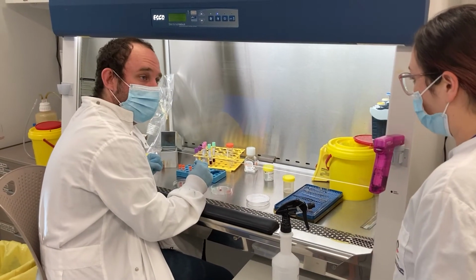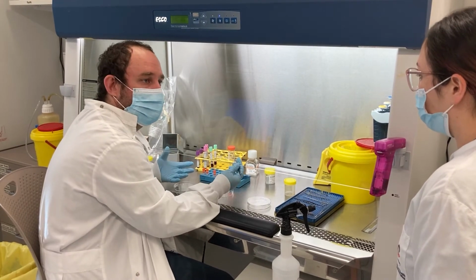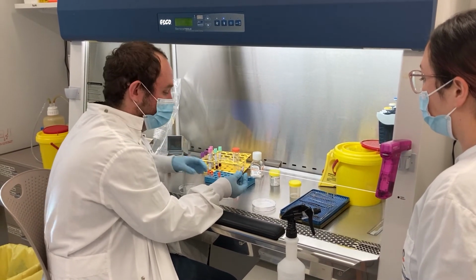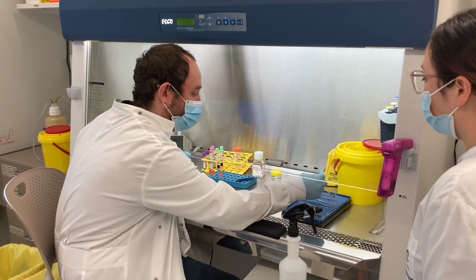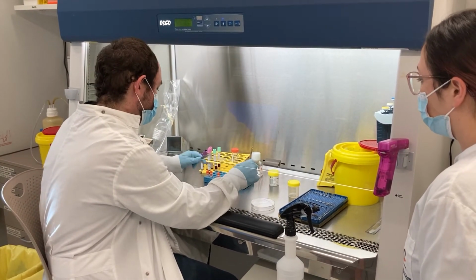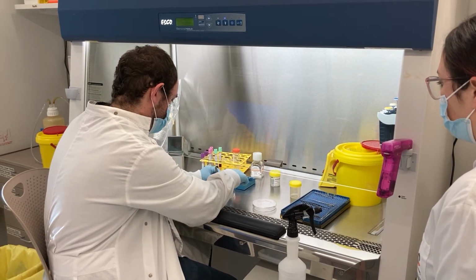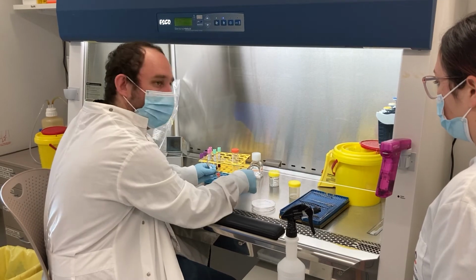We have a few options, and what we'll do is take some for organoids, cryopreserve them, and take some for fresh frozen. And given this tumour is quite friable, we can probably just use the blunt end of scissors to section it a little bit. See how easy it comes out, this one?